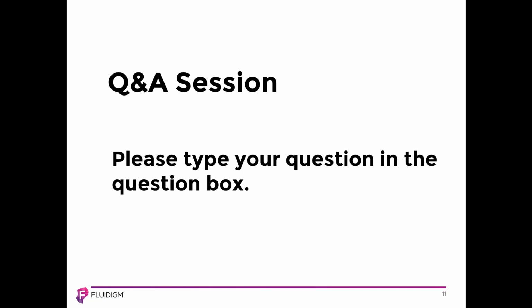Lindsay, could you please provide a little more detail about analyzing IMC data? Sure. So the first step when we're imaging our mass cytometry data and what's in our pipeline is to actually look at your images in MCD Viewer and make sure that the experiment worked, make sure your markers are working and everything looks great. And when you're satisfied with how the experiment performed, you can export your images as single file TIFFs.